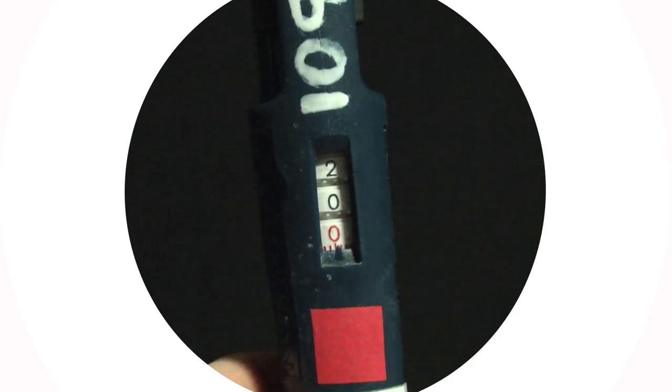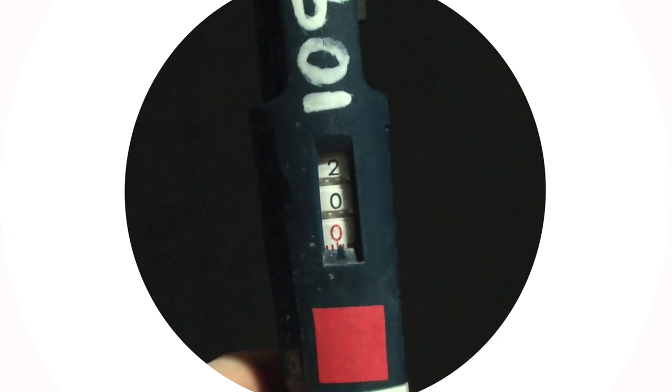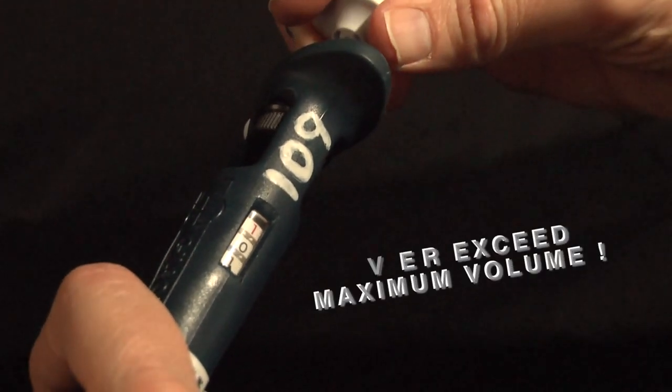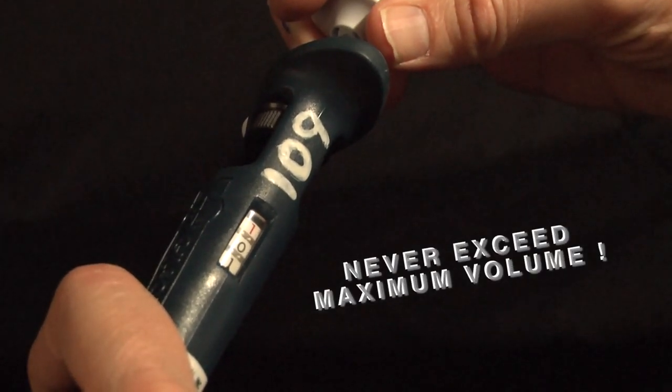It is very important when using the micropipetters that you never exceed the maximum volume by over-dialing the volume adjustment knob. This will cause the tool to lose its calibration and sometimes to become disassembled.